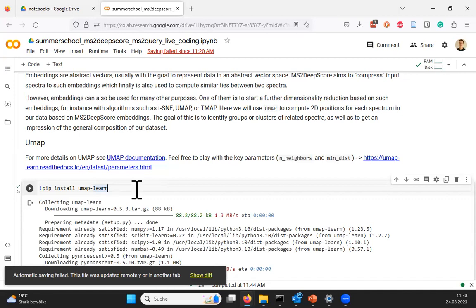There's a number of tools that are meant for what we would call dimensionality reduction. We have seen other tools like this. A fairly common one is PCA. The aim of these tools is, if you have something with a lot of numbers, like a vector with 200 or 500 numbers, you cannot visualize it at all. So what people often do is try to compress it, accepting that we lose information, to 2 or 3 different entities, because then you can make a plot where every data point has a position that you can plot. You can use PCA for it. It's a linear technique. It's not great for all things, but for some it works really well.